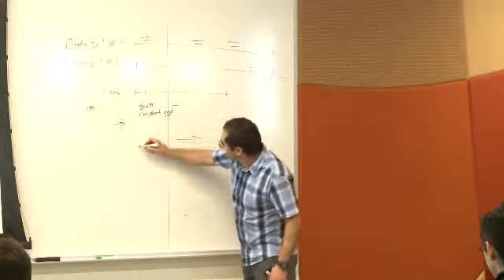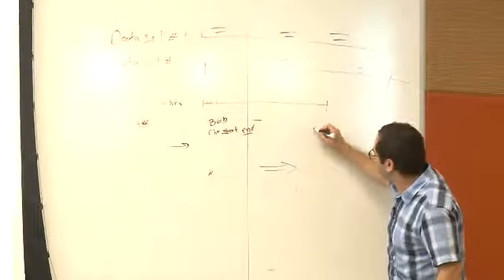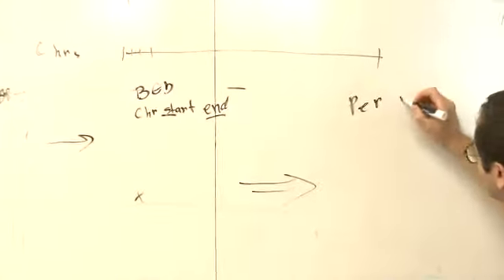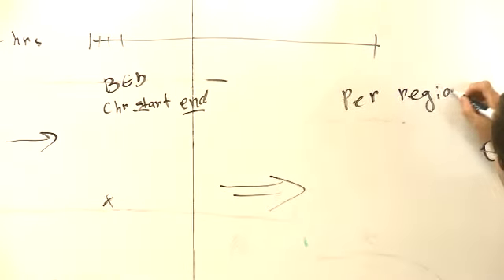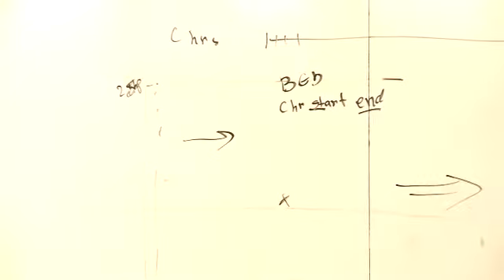And then taking these two parameters, we're going to get a file per each region that we decided, which is decided here, and per the fragment size that we decide, which can be anywhere from 25 base pairs to whatever we want, let's say 1 kb, for instance.